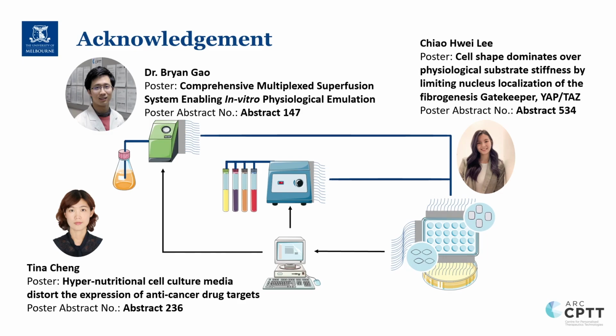You mean for the standardized product or for the cell metabolism measurement system? I mean for the electrochemical sensor. Yeah, under a standardized fabrication process we can achieve calibration-free use, but if we want to achieve a high accuracy measurement for the cell metabolism, we suggest doing the calibration before we start the measurement.